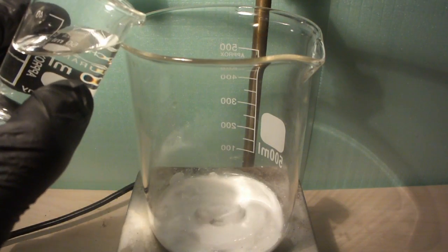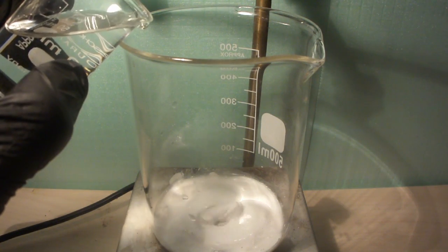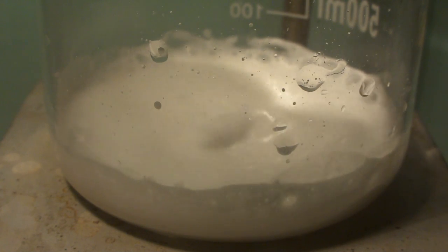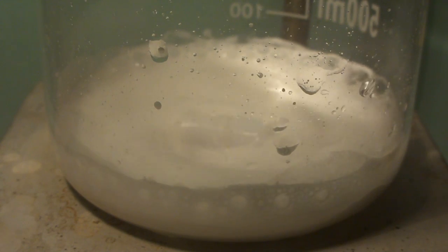Next, we slowly add dilute nitric acid drop by drop until the effervescence from the carbon dioxide gas ceases. It really does not matter if you add in too much nitric acid. Just make sure that no barium carbonate remains.